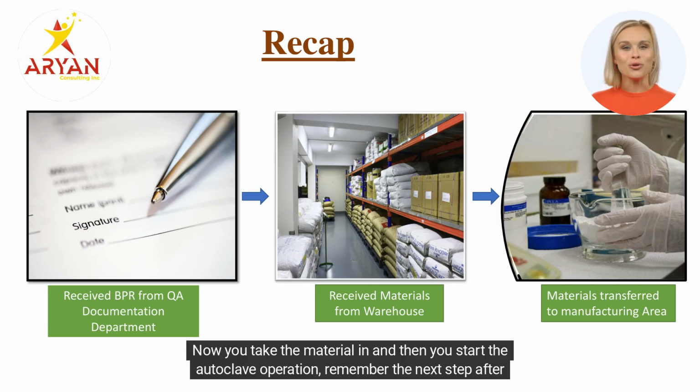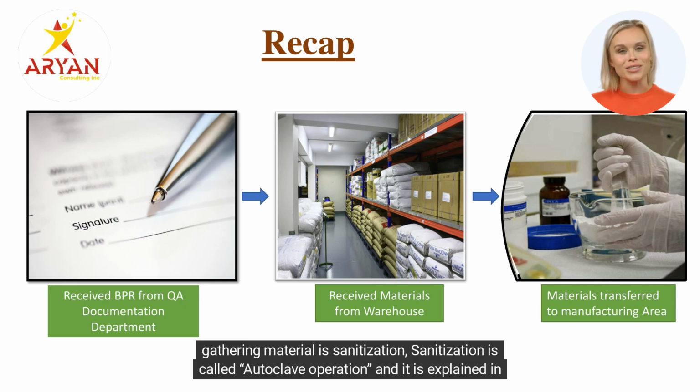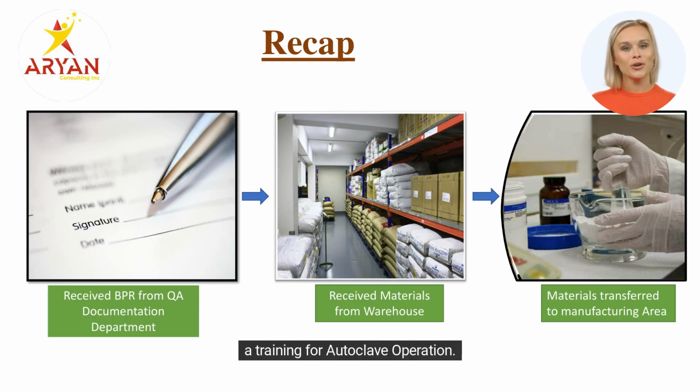Now you take the material in and then you start the autoclave operation. Remember, the next step after gathering material is sanitization. Sanitization is called autoclave operation, and it is explained in a training for autoclave operation.